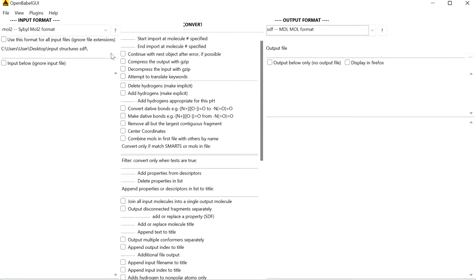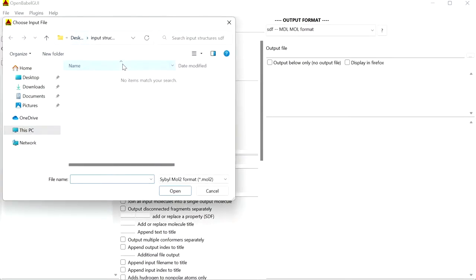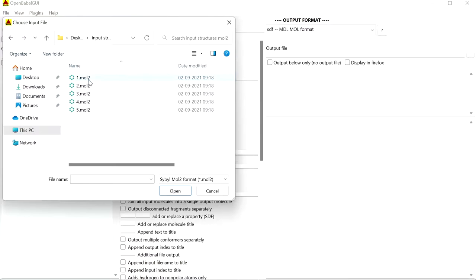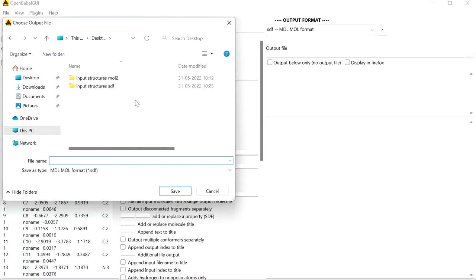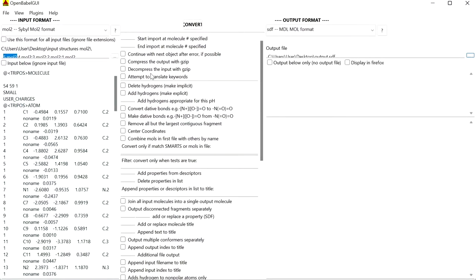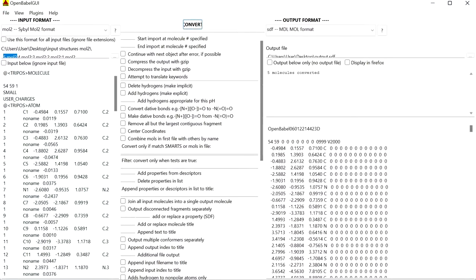Now select the input structures by clicking here. You can select multiple structures by holding down the Ctrl key. Now choose the output file. I am going to choose the desktop and the output file is output.sdf. Now if you want you can change some of the options here and click on Convert. Now you can see here five molecules are converted into a single file.